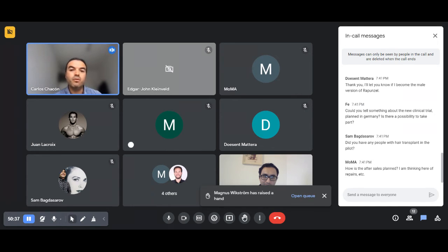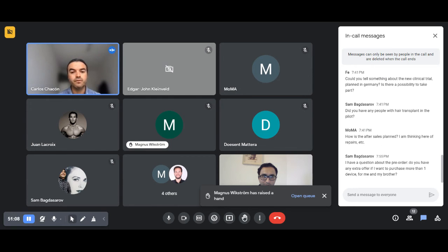Depending on what the problem is, we'll also have some engineers that can help you troubleshoot. We have already started thinking of ticketing systems so that you can contact us, you get a number, and then one of our engineers will focus on that and try to help you. If the device is definitely faulty, you will send it back to us and you will get a replacement, or we will fix it for you. So this is a little bit like standard consumer electronics. We're thinking of that already, although it's in half a year.